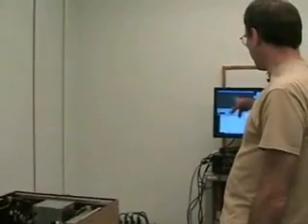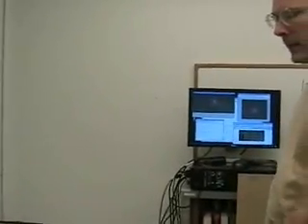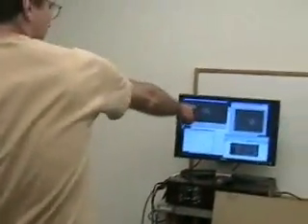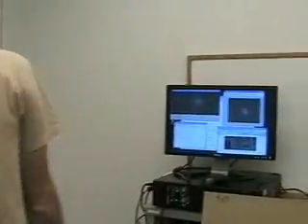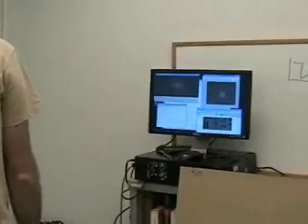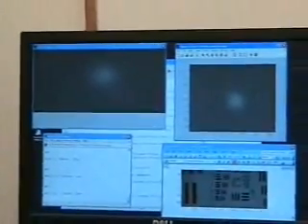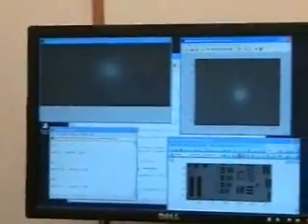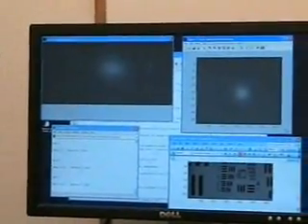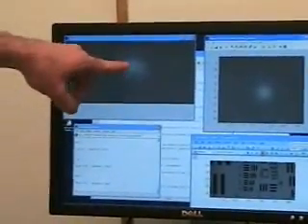So I see something here with my gain and shutter set at maximum. I can click. You'll see that this updates my image. And all I've done is positioned the sample so that white spot here is clear. So I'm focusing back and forth. You'll see it rapidly goes out of focus. I'll come through focus. And little spots and junk you see in the image are just bubbles, and it's partly due to the fact that it's an old sample. When you're in best focus, you'll actually see some diffraction rings in here. And that's one way to know that you focus the laser well on the sample in this particular experiment.